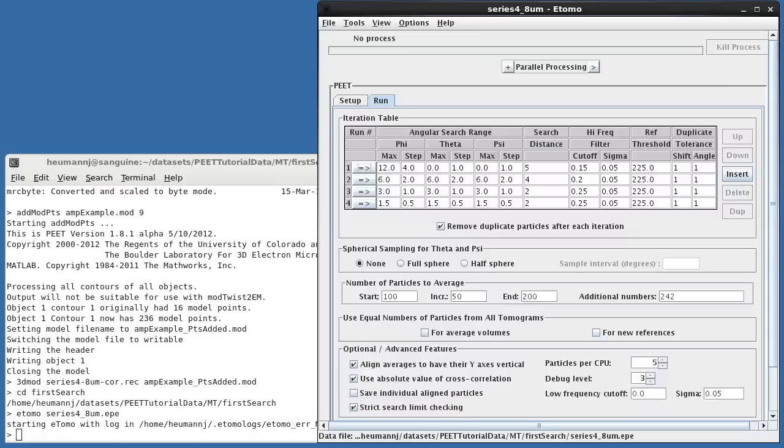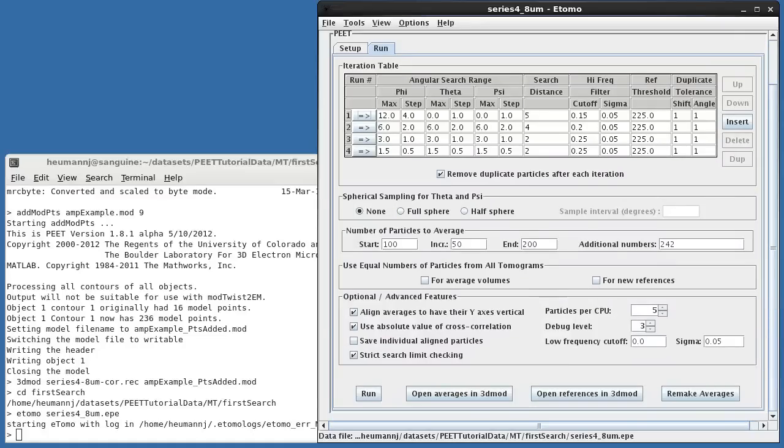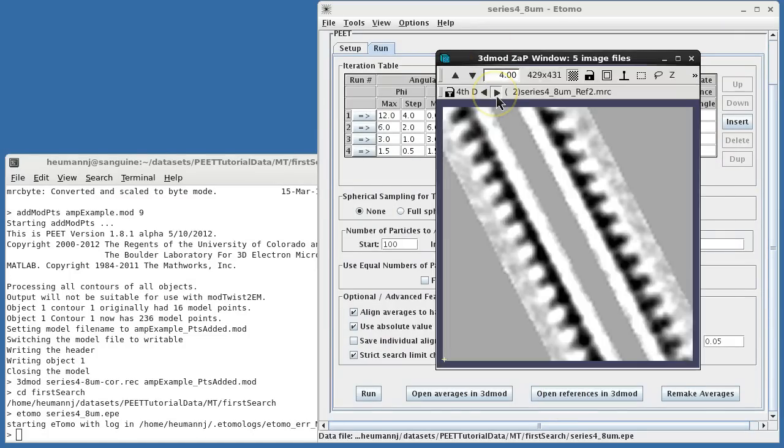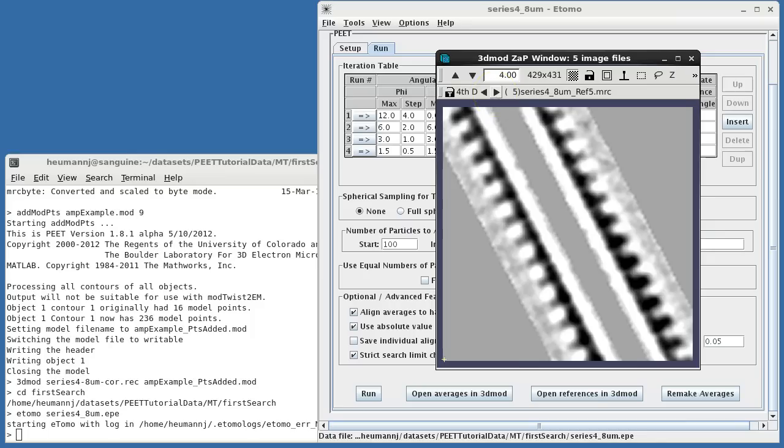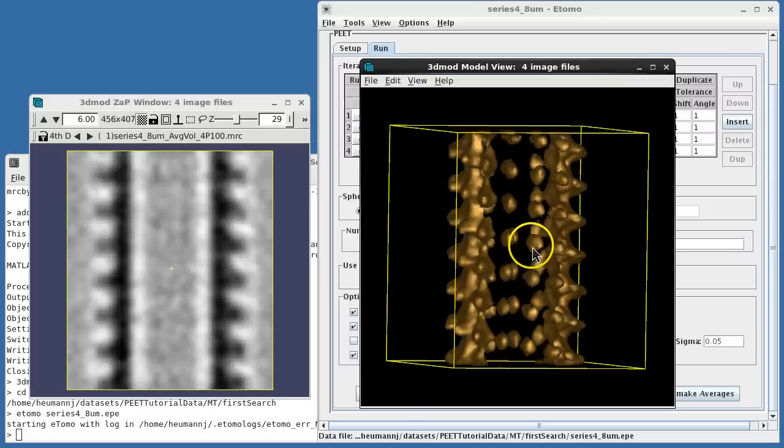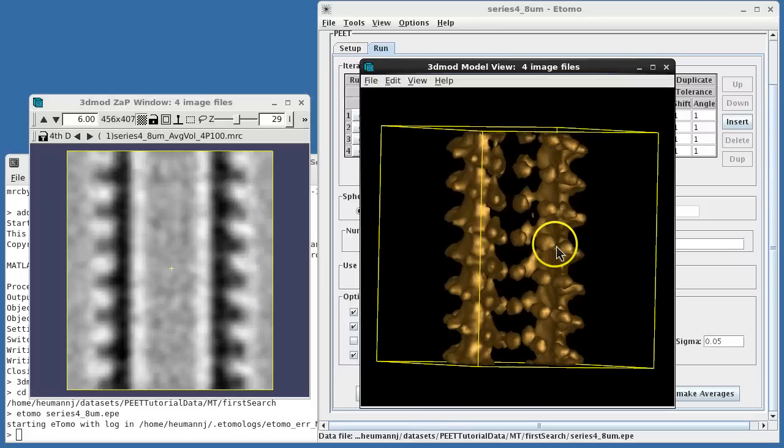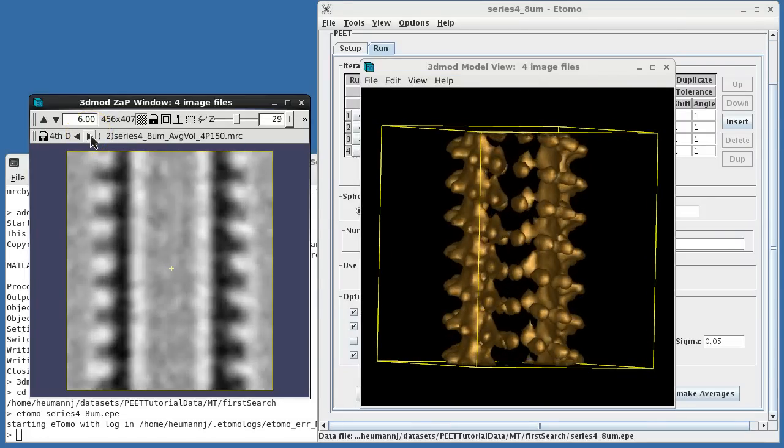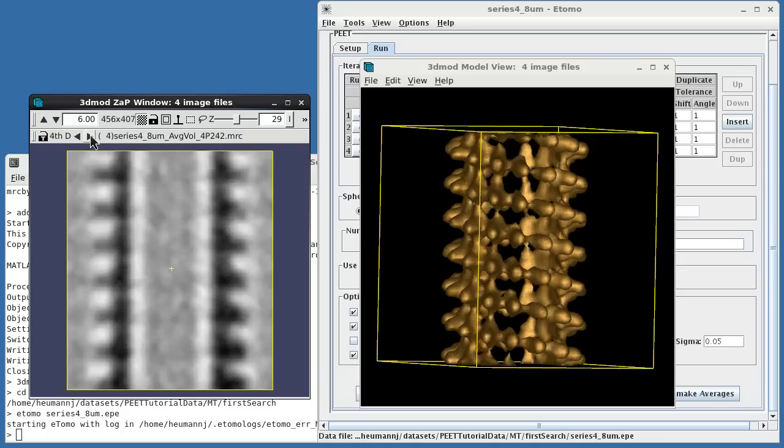I've already run this alignment, so we can open the resulting references and verify that the mask is appropriately sized and positioned. Looking at the resulting averages, you'll notice that the microtubule axis is vertical, as we requested. Additionally, you can see that despite the steps we've taken to minimize bias, there is still some smearing from missing wedge artifacts, particularly when low numbers of particles are averaged.